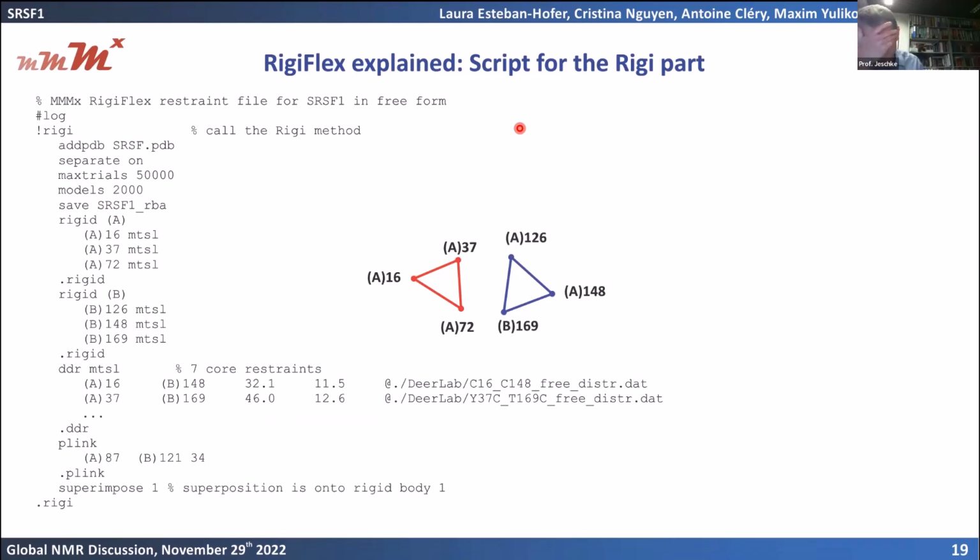To some extent, this is still an open question. For the protein ensemble models, we do not yet have a complete uncertainty estimate. I can tell you why the problem is complicated. We have the distribution of the conformation, and then on top we have an uncertainty of the distribution of the conformation.